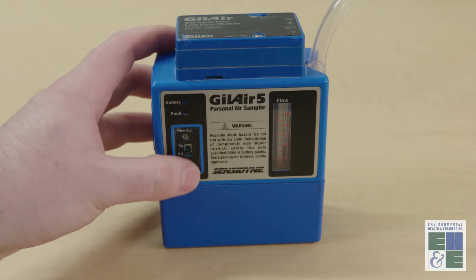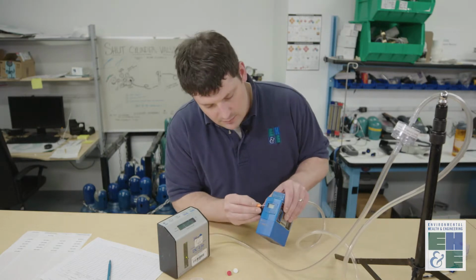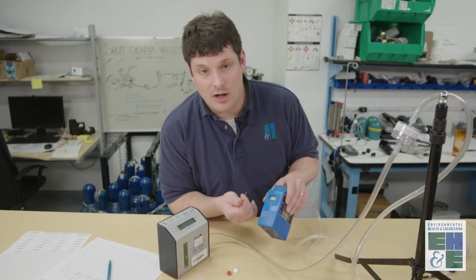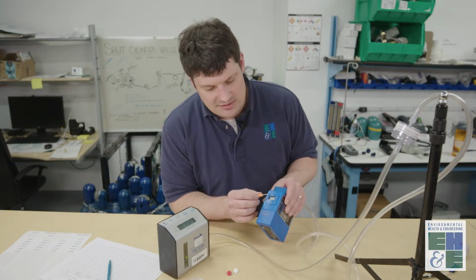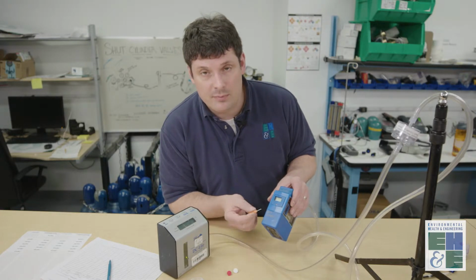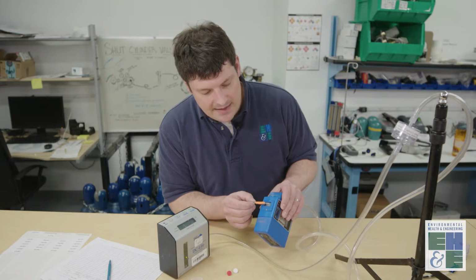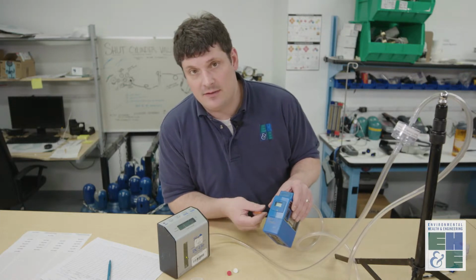The pump turns on just with this switch right here. It's also important, we have a timer here that will count up from when it was started. So if you ever had a situation where the pump fails before you collect the sample, you can actually go back and get the elapsed time from this timer so you can know the actual time that the sample was collected.